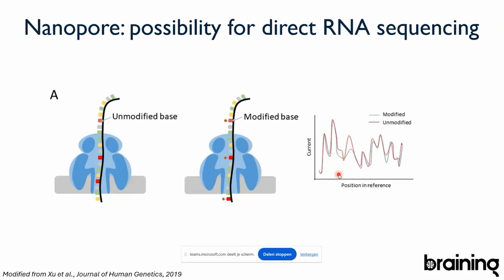So where PacBio, since it's working with the DNA polymerase, you can only use DNA or copy DNA there. However, nanopore works with the disturbance of the current. So what you can do is you can directly take your RNA and you can put it on the pore without making DNA first. And since you are using your original RNA, it means that you keep your original modifications, which you can read out.